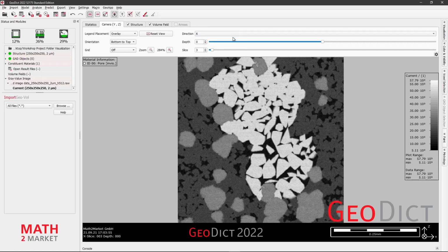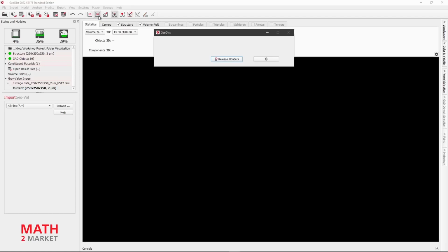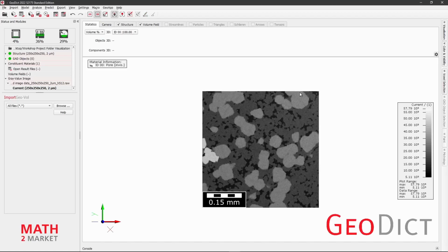Although the 2D mode can be informative and interesting, the 3D mode gives us more visual possibilities to explore our data. To switch to the 3D mode, we use the icon in the toolbar up here. First, we learn how to adjust the position and rotation of our camera in the visualization area to get a better view of our dataset.